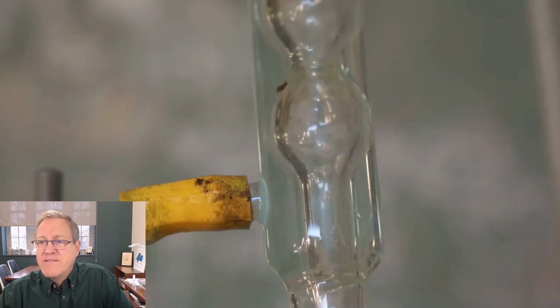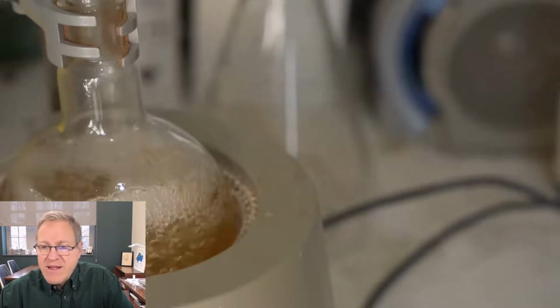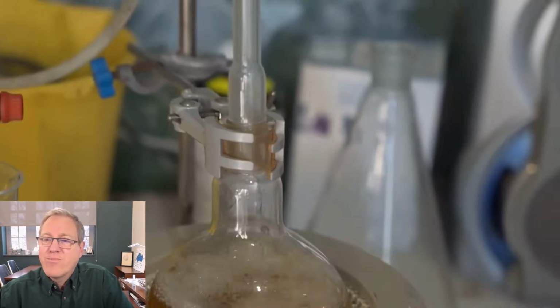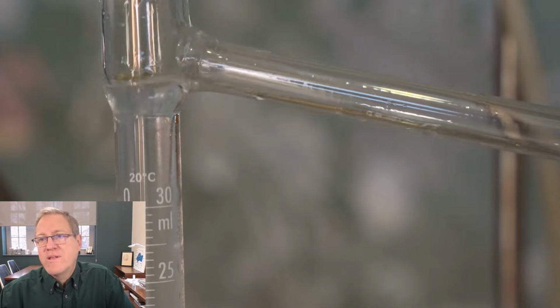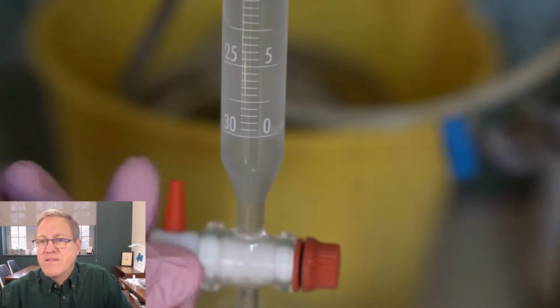Okay, so he's heating this up. He's got some gunk in his condenser lines. No surprise, that happens sometimes. And he's heating it. Something's boiling. It's a little shaky camera here, kind of Blair Witch Project. And he's heating stuff. I'm going to let this go. In a second, I'm going to pause it. And let this go. Okay, so he's draining some liquid out the bottom.